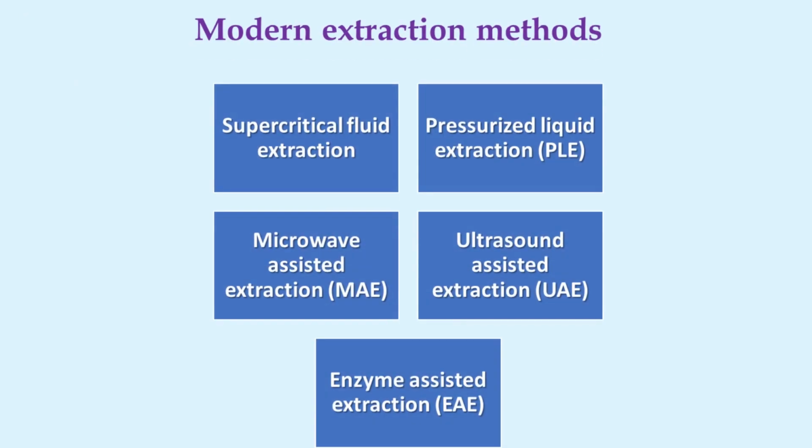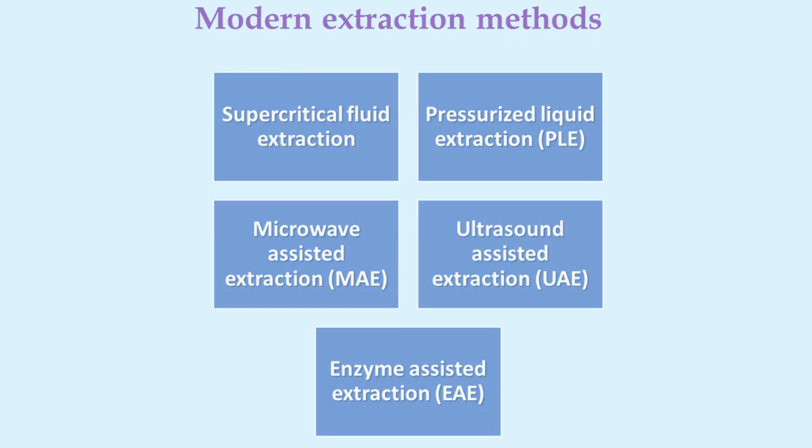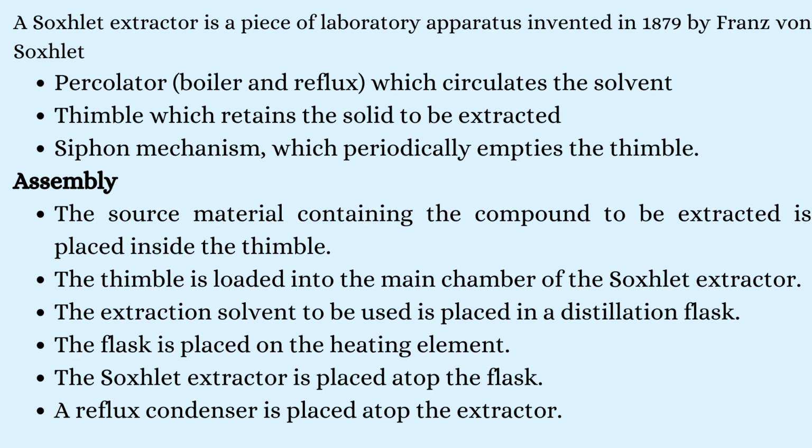And the modern methods of extraction include supercritical fluid extraction, pressurized liquid extraction, microwave assisted extraction, ultrasound assisted extraction, and enzyme assisted extraction. And in this module, I'll be discussing in detail about the Soxhlet extraction.